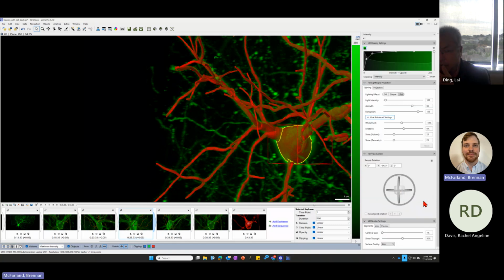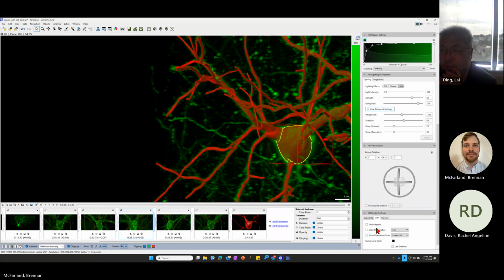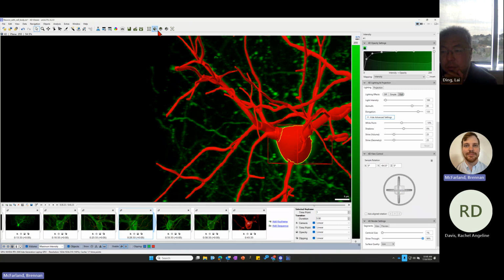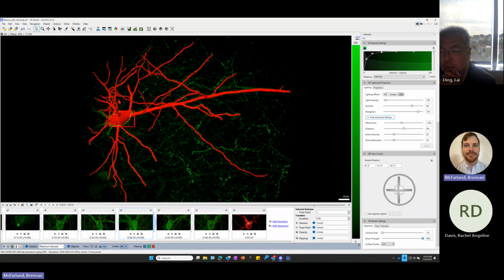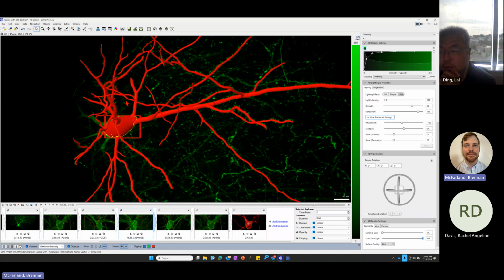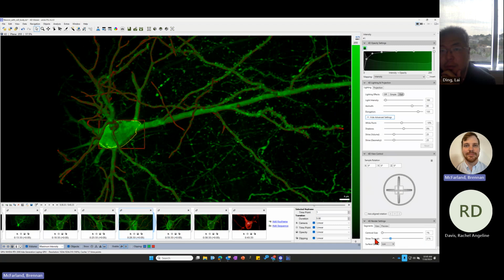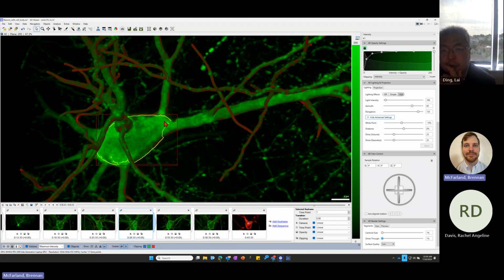I think we did render settings. The other option here is kind of the shine through option. So right now I have it at 100%, so it's going to be pretty opaque. It's kind of like another layer that you can add onto this standard material or glass material for visualization. So I can reduce the shine down and have it as sort of like a glass rendering. But they seem to be similar effects.